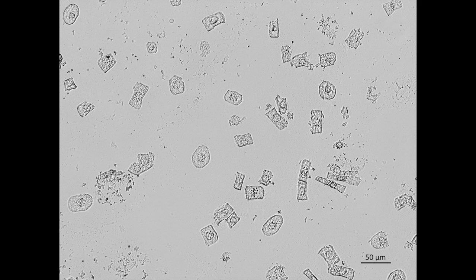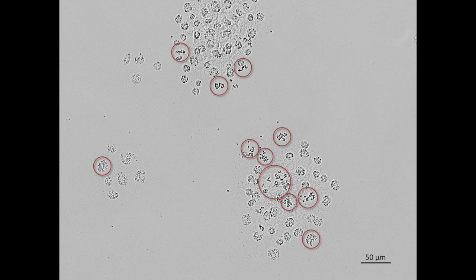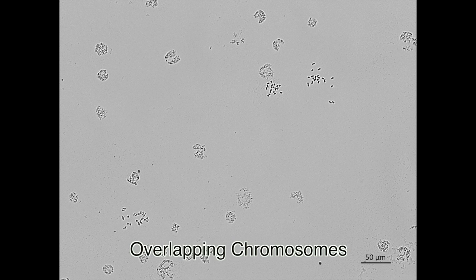In slides that are slightly more digested, the walls and membranes of peripheral cells begin to break down. While chromosomes are now visible, they are generally not accessible for hybridization and should only be used for extremely robust probes. While spreads are now readily visible, cytoplasm still surrounds the chromosomes and will appear as fluorescent background. The spread on the left is probably usable for visualizing large target probes, assuming the background level is acceptable for your application. Less cytoplasm surrounds these spreads, however, some chromosomes may overlap each other.